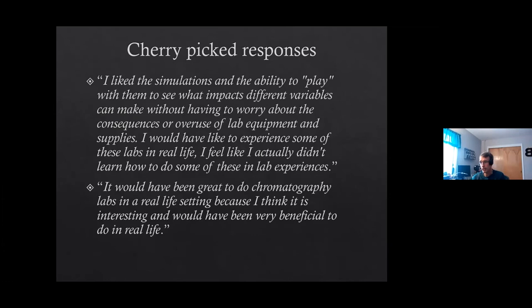Both this student and the next one indicate that they would have really liked to do chromatography in real life. Obviously, I would like them to do chromatography in real life, but it does give me some ideas that this would be a useful tool to maintain, even when we do get to get the students into the lab and actually use the instruments. We run into a problem. I've got one HPLC and two GCs that students can actually use, and getting 50 students through the use of three instruments is a logistical challenge.